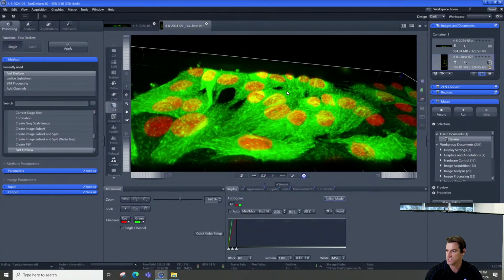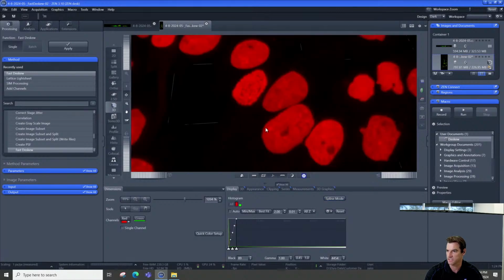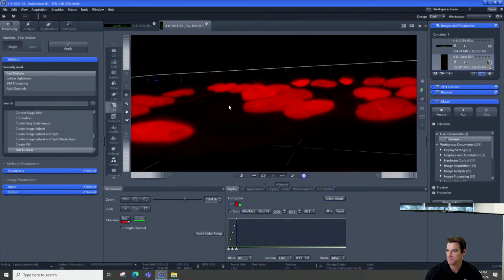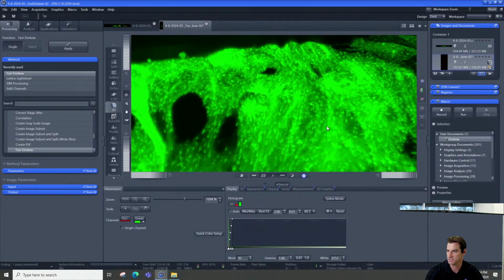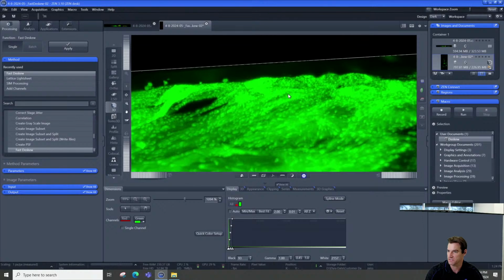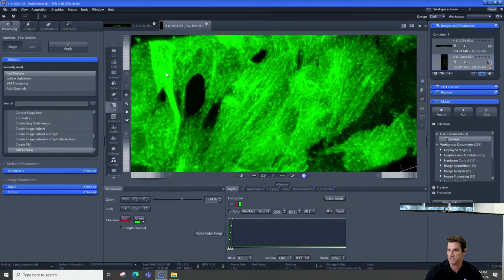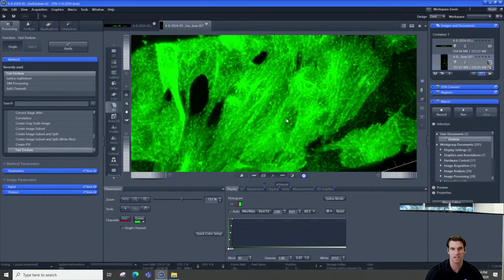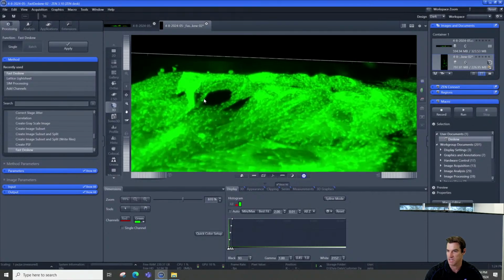And there we go. So what we're looking at here are some cells that are labeled with H2B in red. That's a histone binding protein. In red, so you're looking at the nuclei. And in green, that's end-binding protein 3, EB3. So in here, you can actually see some microtubules that are arranging here right before this cell divides. And the rest of these, it'll look like little comets shooting through the cells as you take Z-stack time lapses.